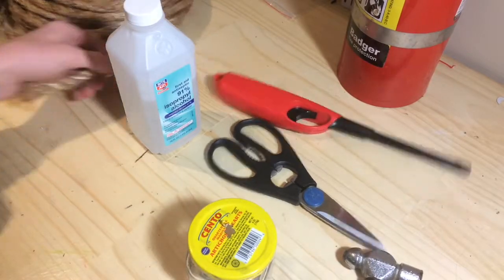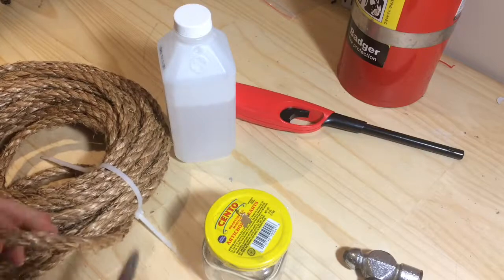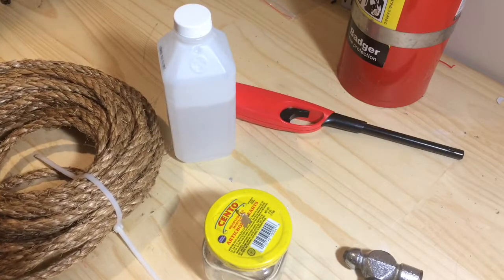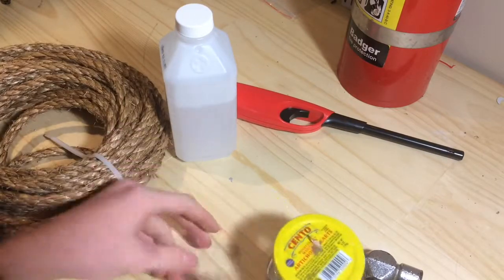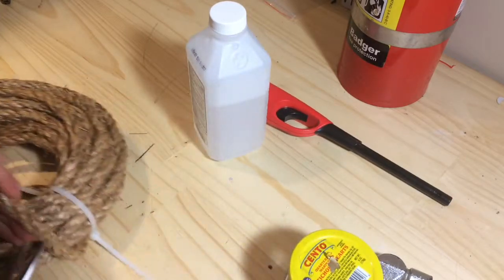So now what you want to do is get a nice piece of your rope — I'd say like maybe about two inches.